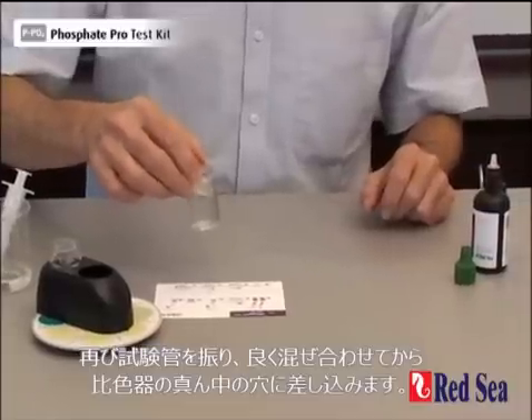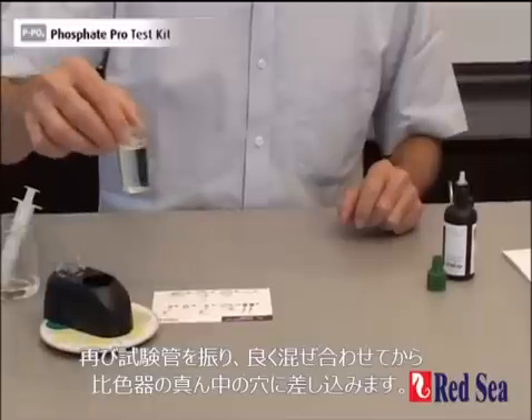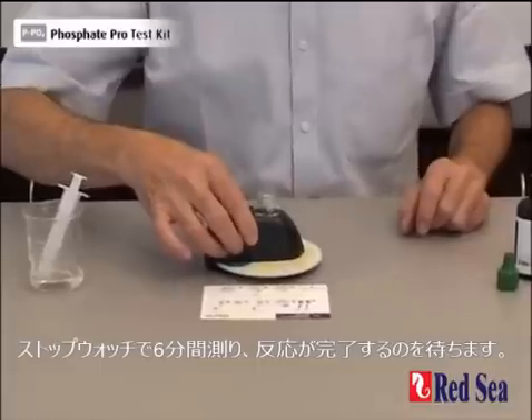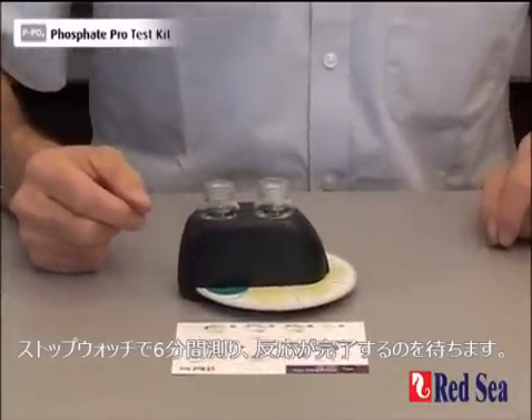And we're going to place the reaction vial into the center of the comparator. We now set our stopwatch for six minutes, which is the time it's going to take for the reaction to be ready.